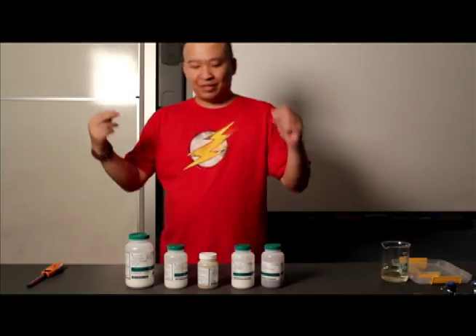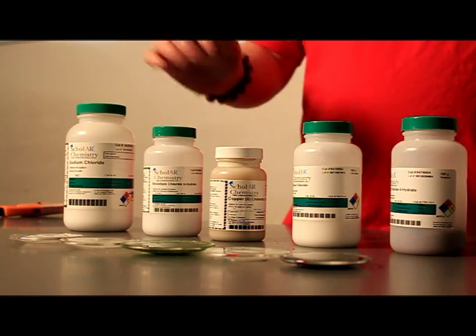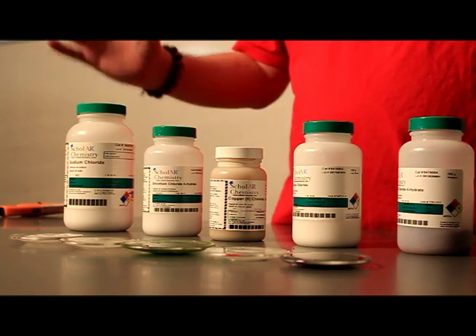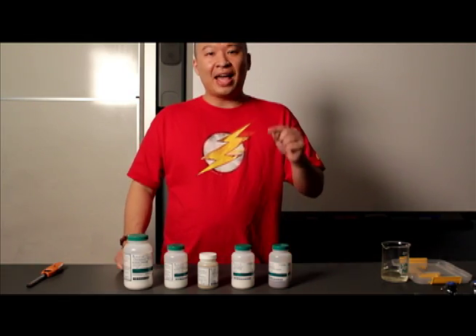Welcome back, chemgeeks. I have a spectacular demo for you today. It involves a little bit of fire, a lot of alcohol, and a lot of salts. Salts are ionic compounds, meaning that they're made from metals and non-metals.